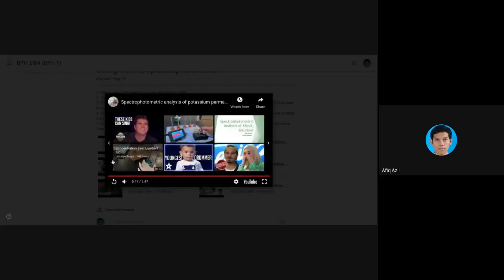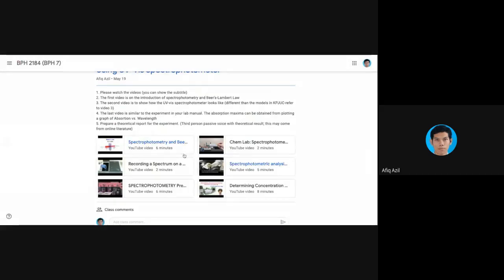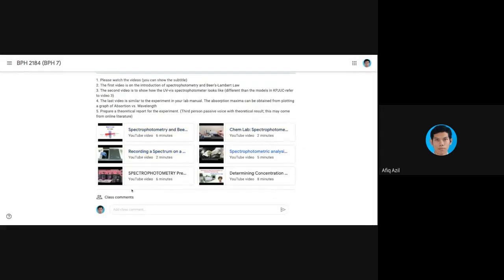Okay, so I'm just going to show you all those 4 videos first. And there are 2 extra videos which you can watch later. These 2 are slightly longer, but they are still the same, which is spectrophotometry analysis of potassium permanganate as well, using slightly different brands of the UV-Vis spectrophotometer.